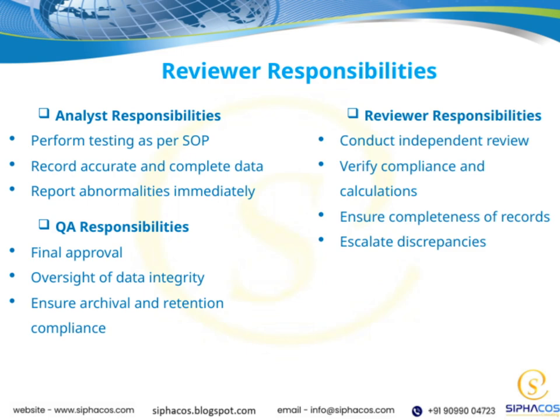Moving on to the analyst, their main responsibility is to perform testing according to the Standard Operating Procedures, or SOPs. Accuracy is crucial here, so they must record data precisely and ensure it's complete. If they observe any abnormalities or issues, they are required to report these immediately, so they can be addressed without delay.